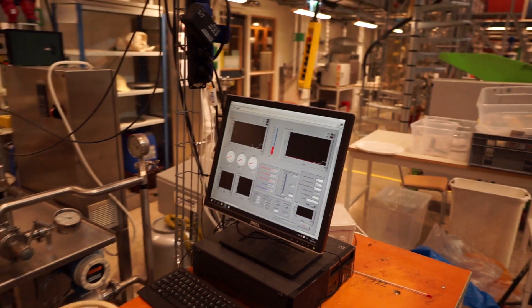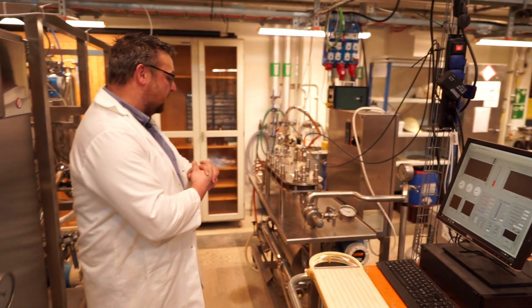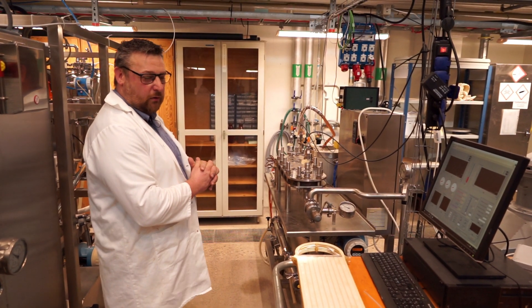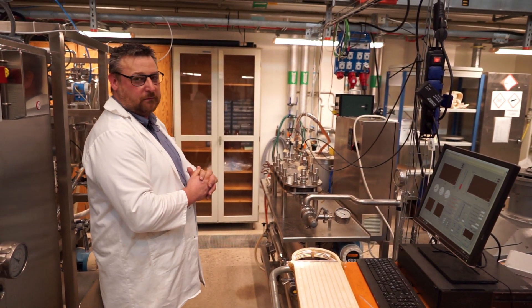Is there anything more we should say? No. I think this is basically it about this membrane equipment. Now you should be able to draw a flow chart of this. Okay. Thank you.